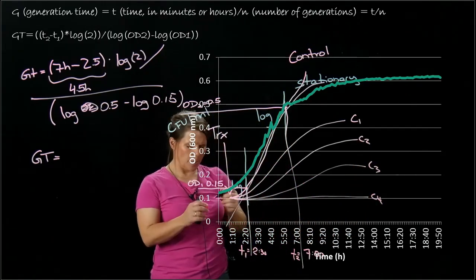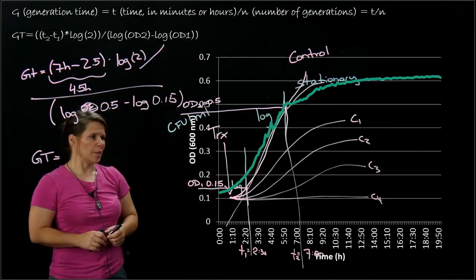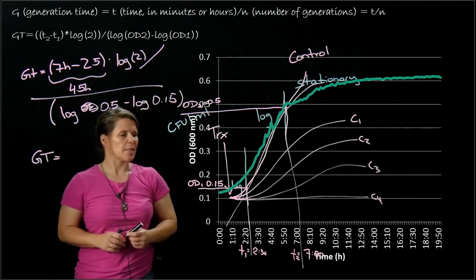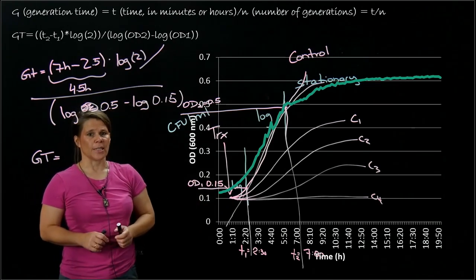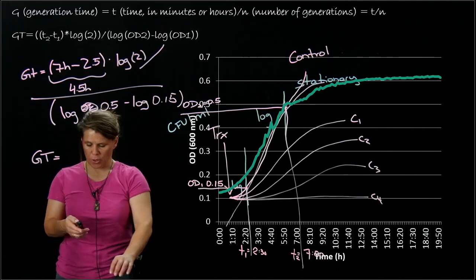And you can see the inhibitory effect of your treatment on the cell growth. You will get a growth rate for each of these different treatments, and then you can compare it and do statistics on it and determine if it is statistically different. Hope it makes sense.